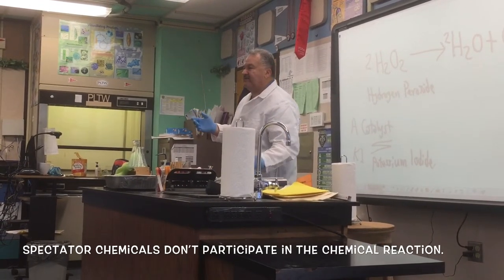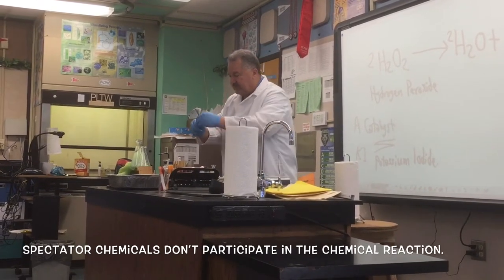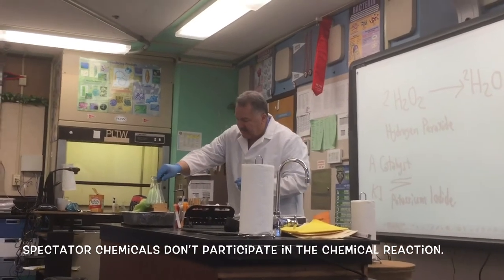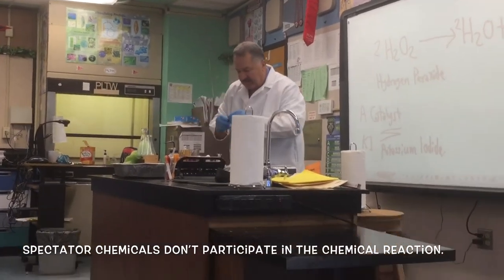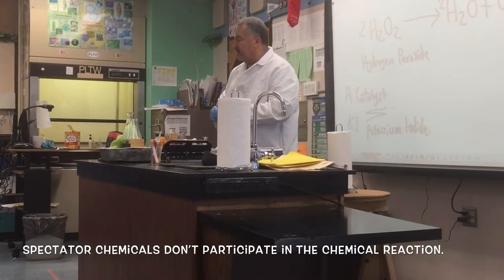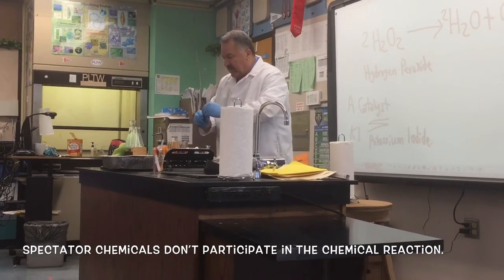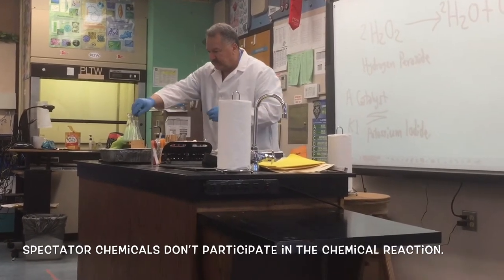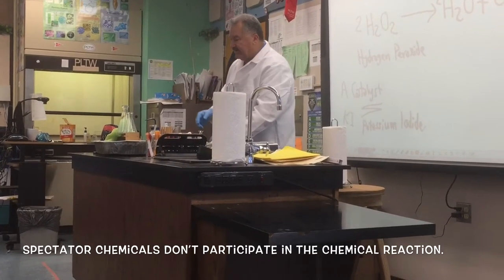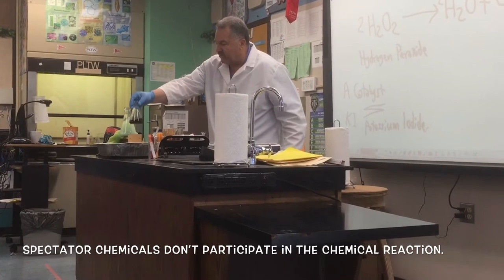Which colors would you like to use? Red? Okay, let's use red. Purple. I like beige. Any other colors? Blue. Okay. Here we go. At this minute, if you pay attention, I'm going to mix the hydrogen peroxide with the color.